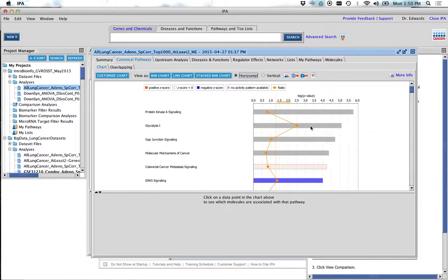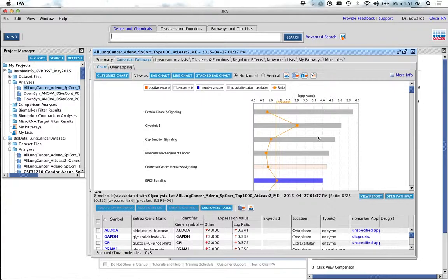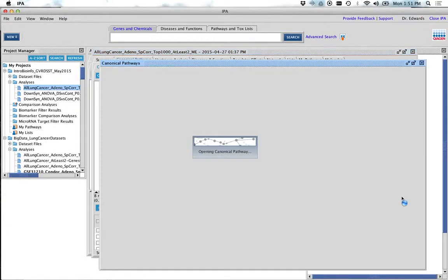Let's take a look at glycolysis for a minute. And you all remember glycolysis, right? Yes, I love talking to high school kids because it's fresh in your mind. You talk to grad students, they're like, sorta. Okay, open pathway.